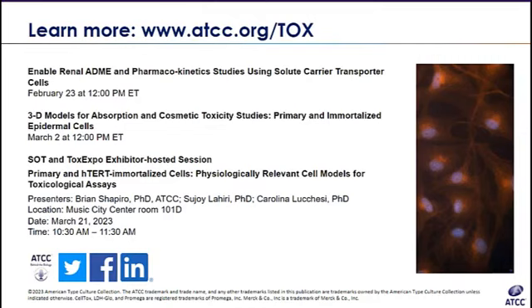All right, good. I like this question a lot. How many copies of the transporter gene insertion are actually in the cells, and how do we verify that? Yeah, that is a good question. We did verify the insertion copies by PCR, and it shows there are 5 extra copies of the OAT1 gene insertion and 3 copies of OCT2.